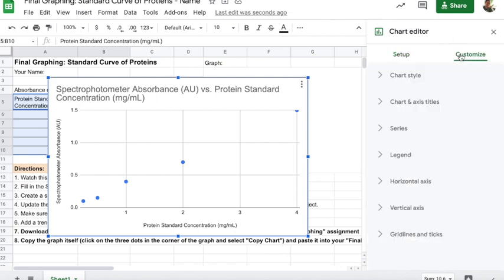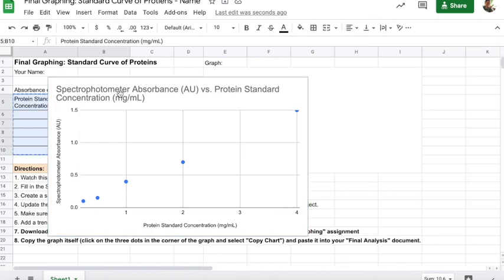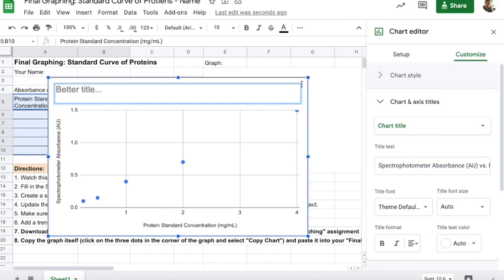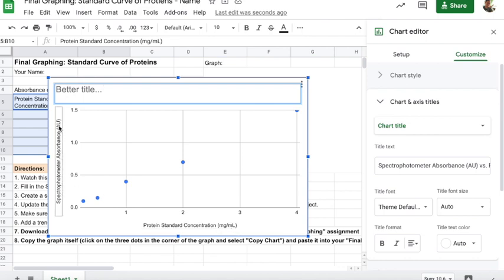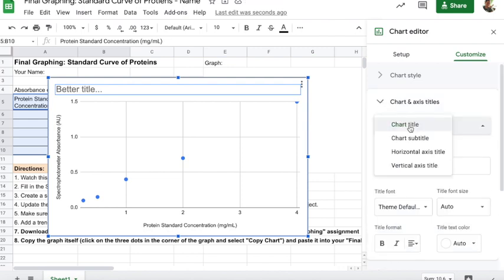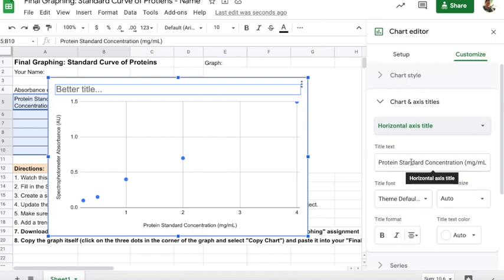Then go to Customize. The first thing to customize is the title — the default title is not a good title, so double-click and give it a better one. It should include the independent variable, dependent variable, and subject in a clear phrase. Also check that the axes are labeled with units: the bottom should say 'Protein standard concentration in milligrams per milliliter,' and the side should say 'Spectrophotometer absorbance in AU.' If either are missing, go to Customize, select the Chart and Axis Titles dropdown, and add them there.